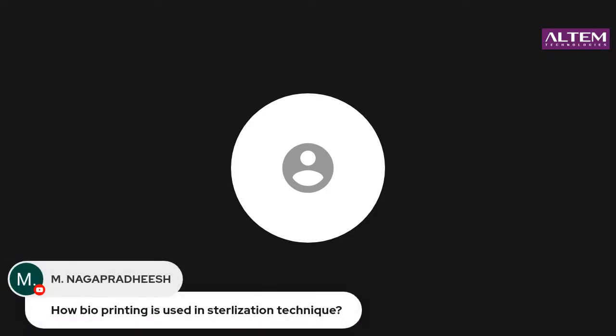I think I can re-answer this question for you. How bioprinting is used in sterilization technique. I'm not sure what you're trying to mean from this question, but what I would like to say is that when you're doing the bioprinting process, you have to make sure that there is an aseptic environment.